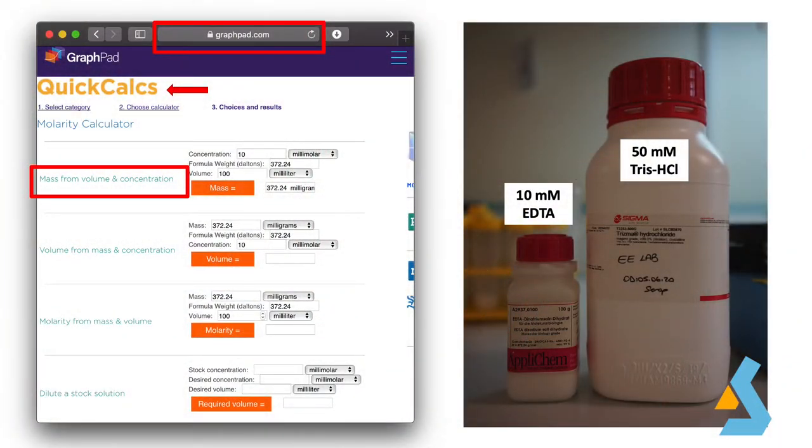For the calculation, if you do not trust your dimensional analysis or you just want to simply save time, you can use the GraphPad Quick Calculations website. At the very top, you can calculate the required mass from volume and concentration. Once you type in the final concentration, molecular weight of your chemical, and the final volume of your mixture, you can obtain the amount needed. For example, for a 10 millimolar 100 milliliter EDTA solution, we need to weigh 372 milligrams of EDTA powder.